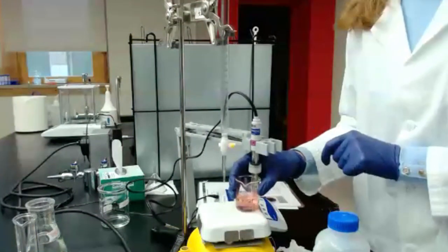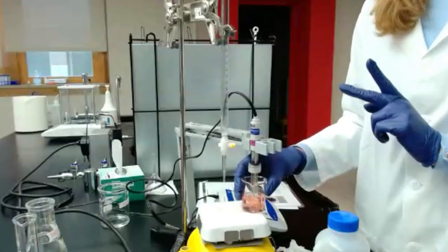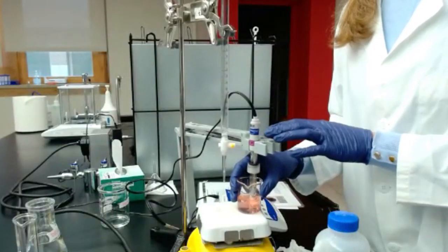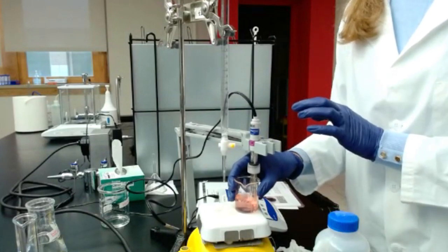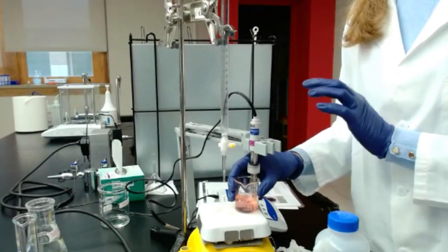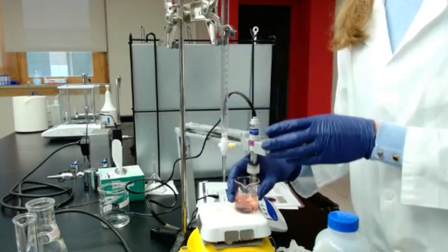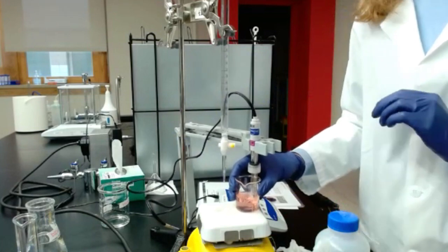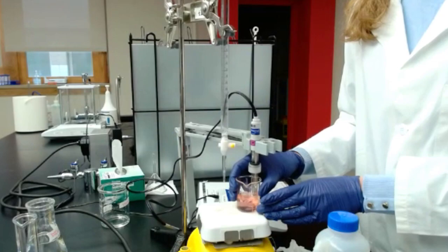It really varies depending on the pH meter. One thing to consider as well is the temperature. Some probes already have a temperature probe, and some other probes have a temperature probe on the side. You will have to make sure your solution is always under the same temperature, so the temperature is always being measured.